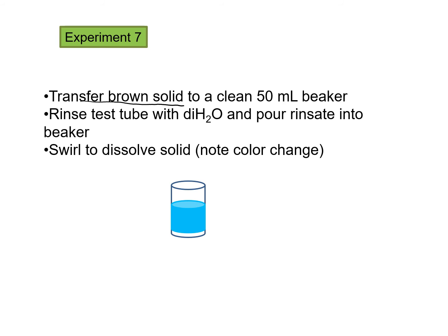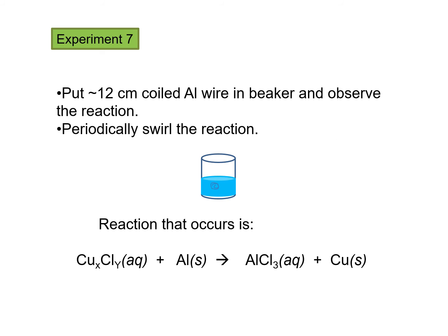Next, take the brown solid from the test tube and put it in a clean beaker. Use DI water to rinse the test tube to make sure all of the brown copper chloride solid gets into the beaker, then swirl to dissolve it. Observe any color changes and record them in your lab notebook. Now you have your copper chloride aqueous solution in the beaker. Get a 12-centimeter aluminum wire, coil it up, and add it into the beaker. Record any observations you see.